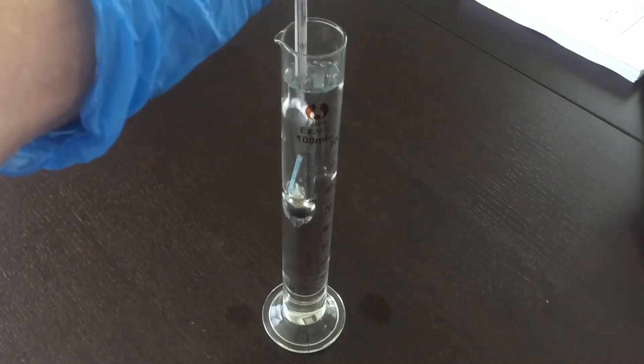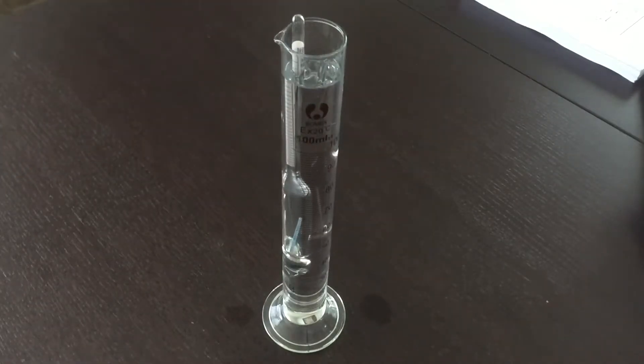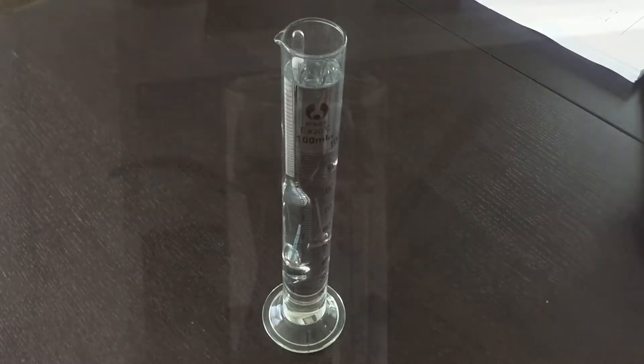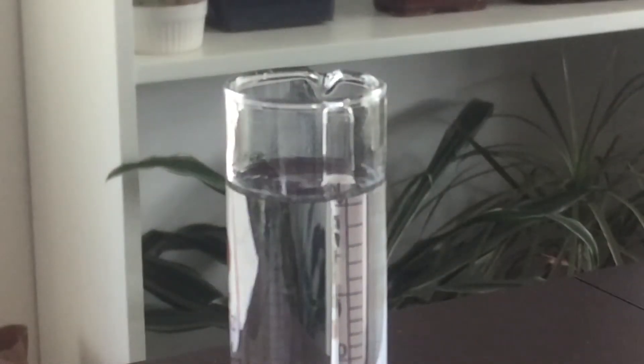As you can see it floats right about to the 100 level. So it's pretty pure which is what I expected. And that means that these actually work so I was happy to see that.